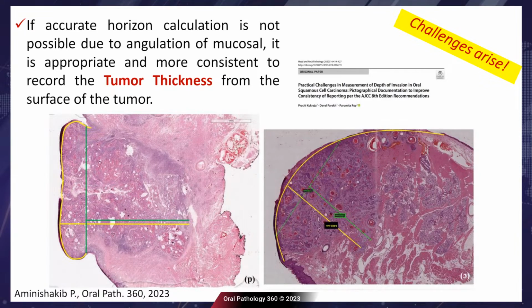During recent years, challenges have arisen. When you have a squamous cell carcinoma with angulated mucosa, it is recommended to use tumor thickness instead of depth of invasion.